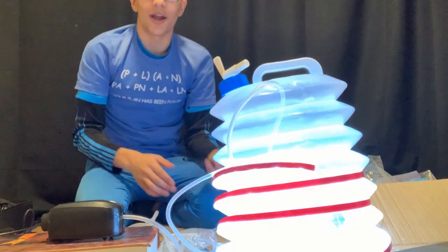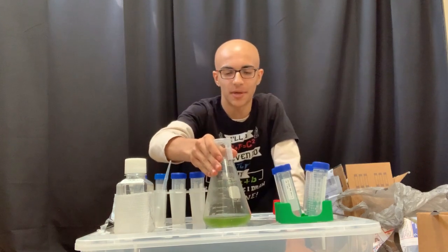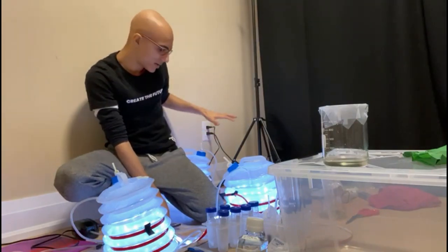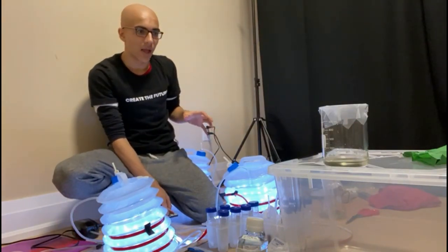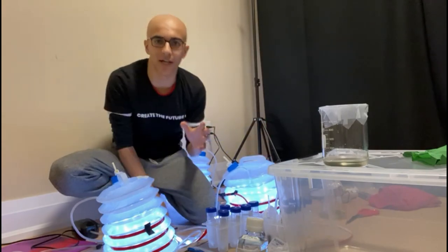So there we have it, a fully working photobioreactor. I now officially have started my experiment by growing microalgae in this tube. And these bioreactors are going to be sitting here growing microalgae and absorbing nitrate and phosphate from the water inside. And that's my entire experiment.